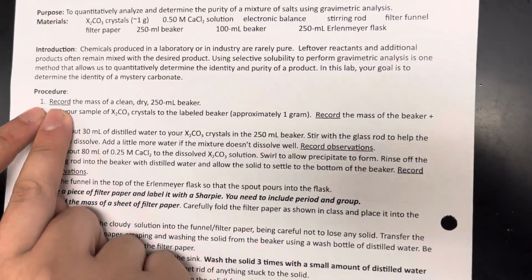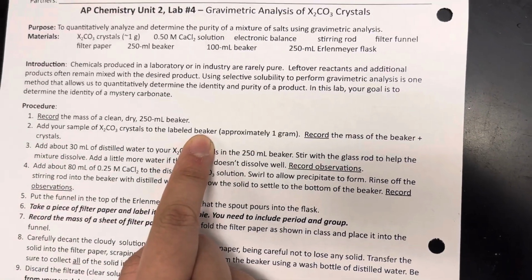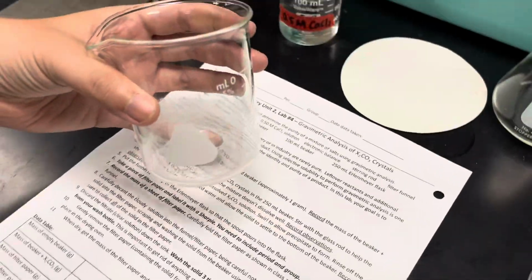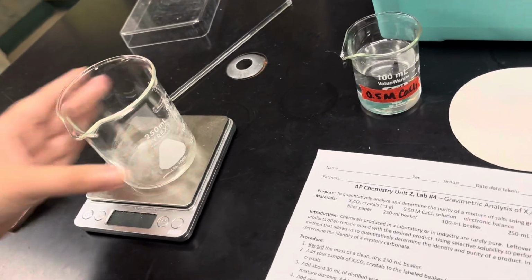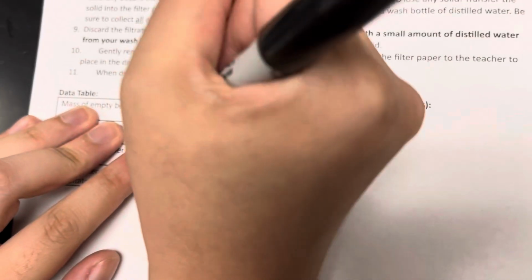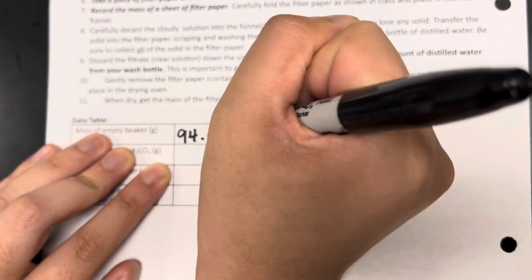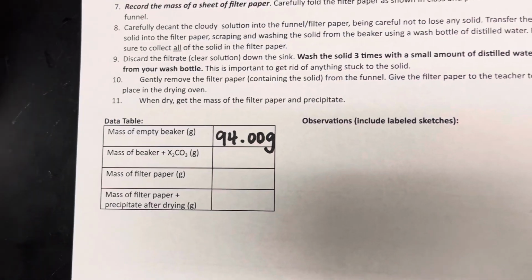So the first step is to record the mass of a clean, dry 250 milliliter beaker. This is our beaker over here, and we're going to get the mass of the beaker on the balance. I'm going to write down what I got on the paper, so go ahead and copy this number. We got 94.00 grams for our beaker, all right?